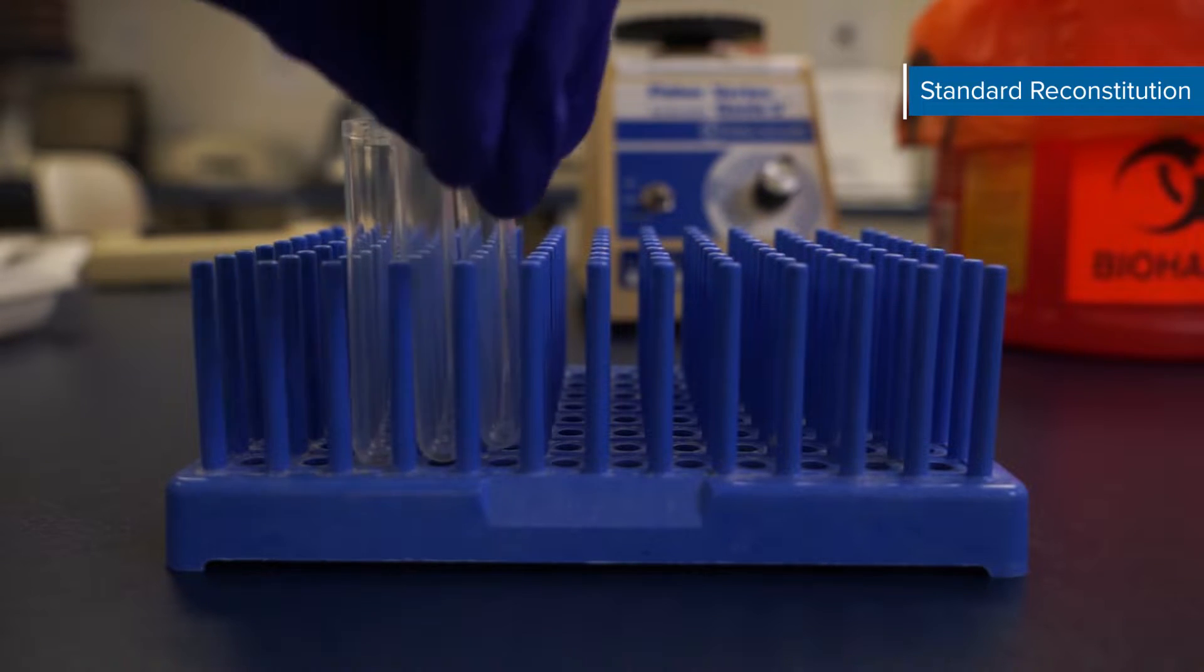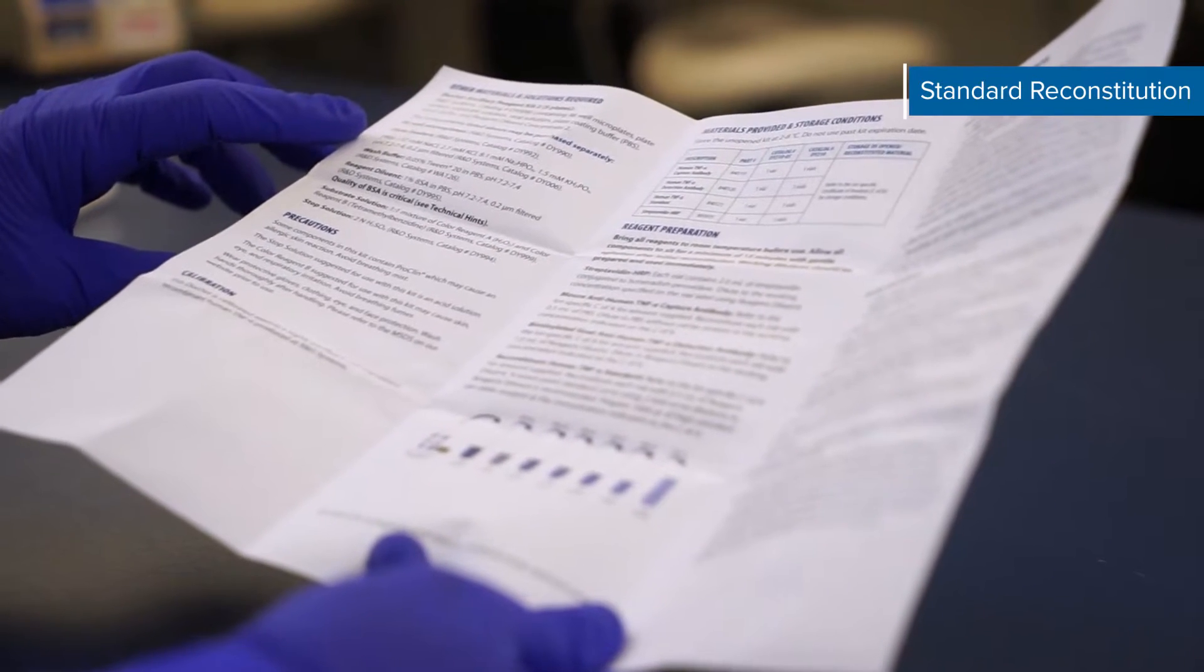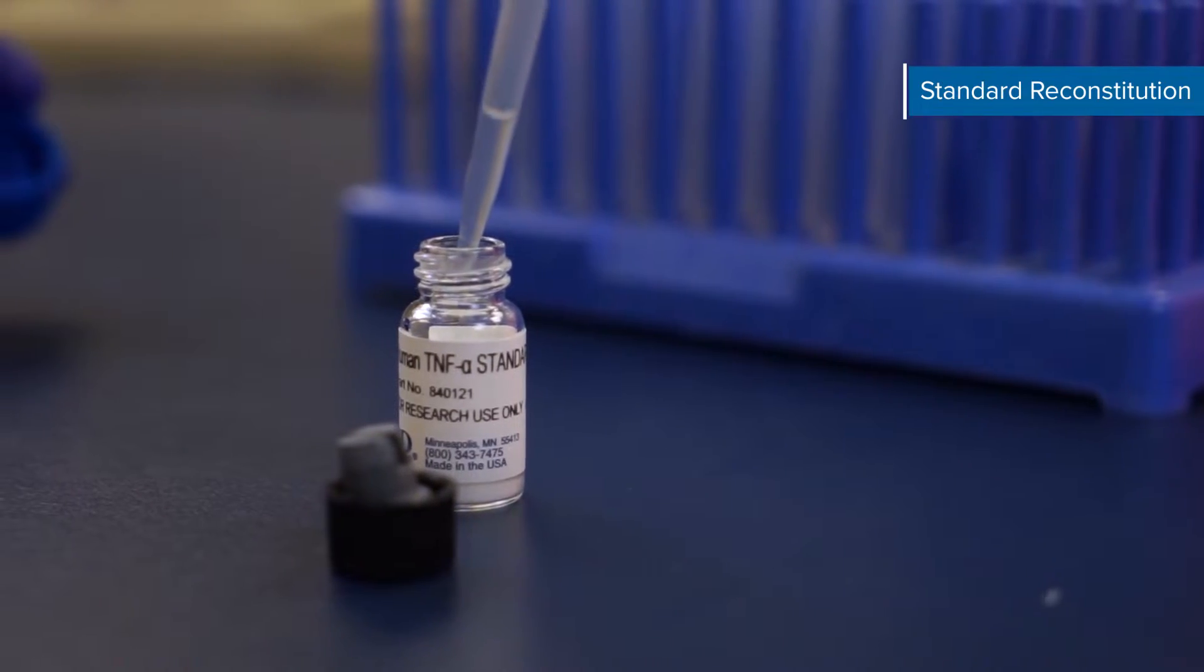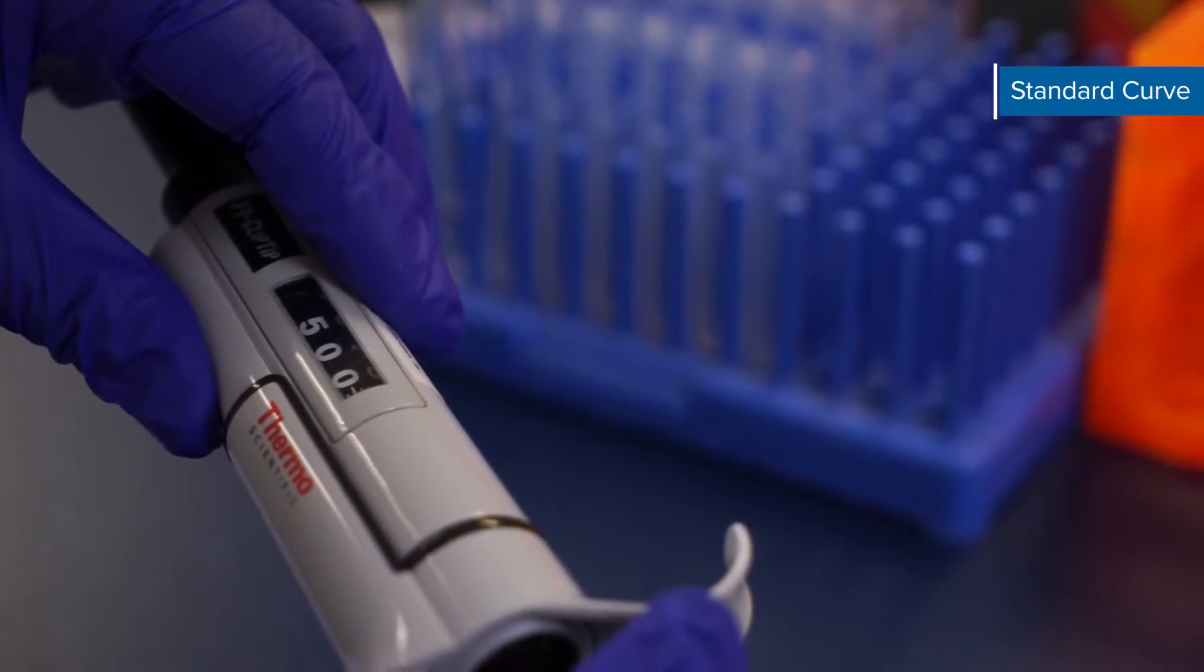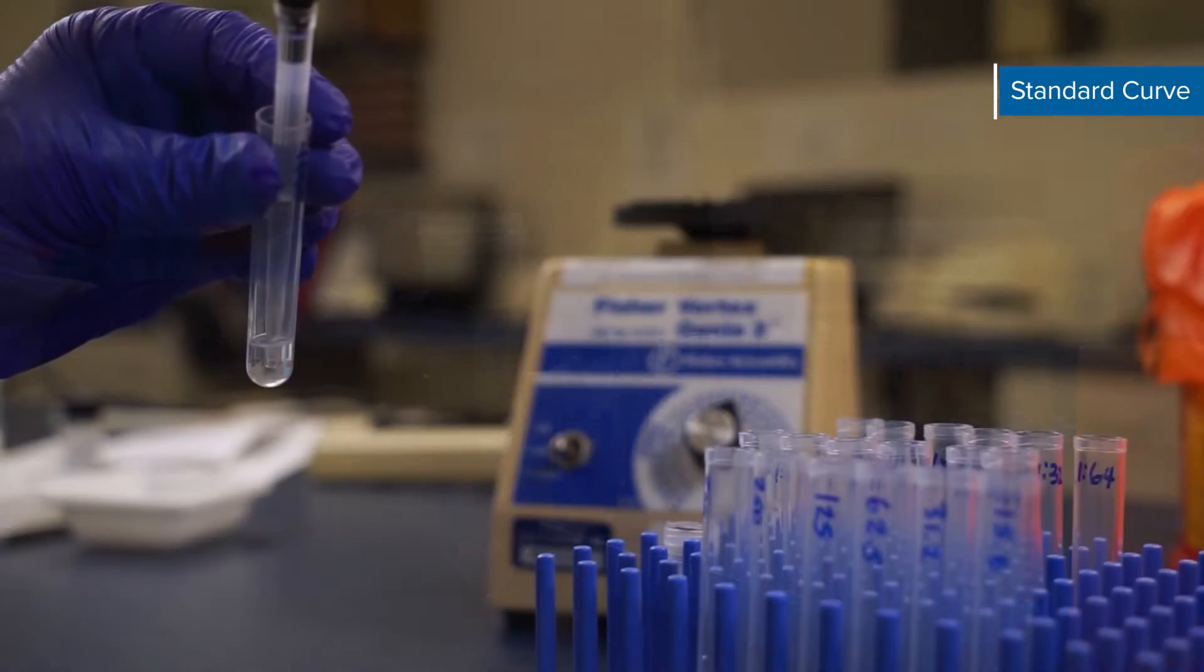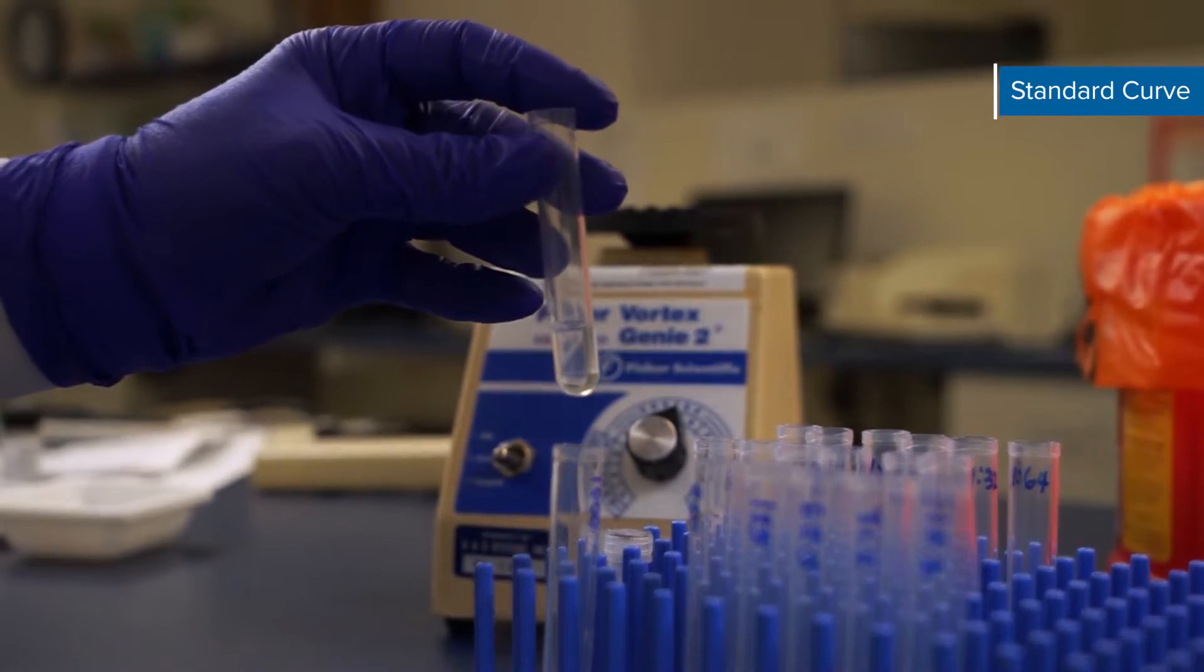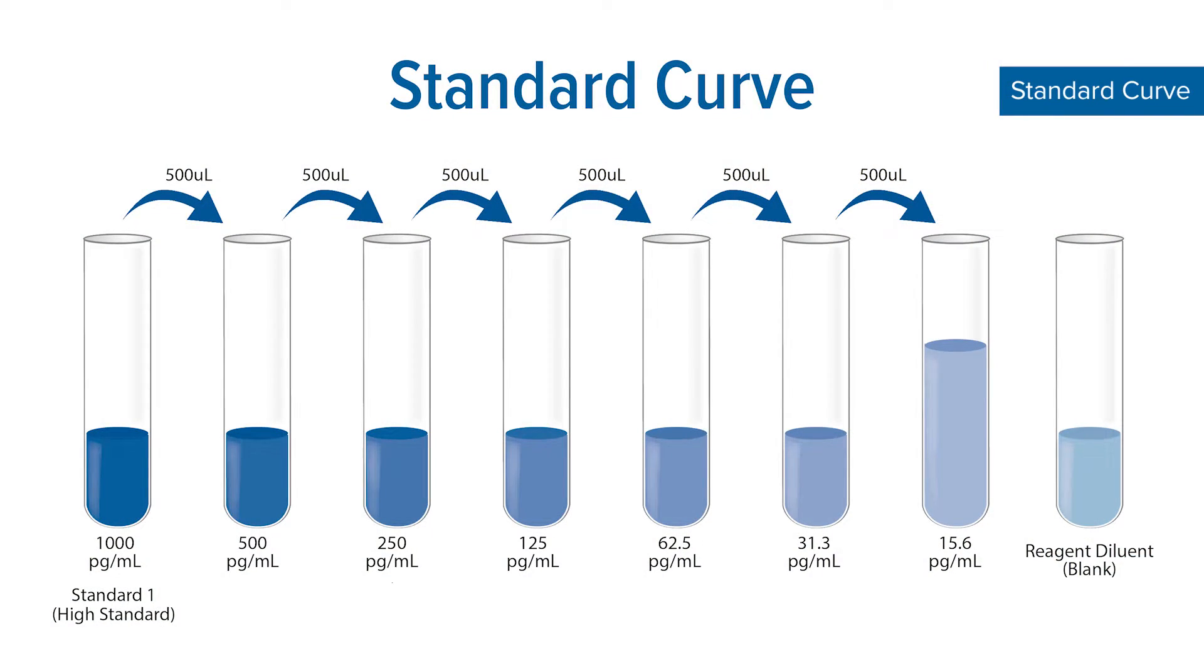The standard curve should be prepared last so that it may be added to the plate with minimal delay. A seven-point standard curve using two-fold serial dilutions is outlined in the assay insert. Prepare 1000 microliters of high standard per plate and place it in the first tube. 500 microliters of reagent diluent is added to the remaining six standard curve tubes. Serial dilute the standard curve by transferring 500 microliters from the 1000 picogram per milliliter standard to the 500 picogram per milliliter tube. Gently mix then transfer 500 microliters from the 500 picogram per milliliter tube to the 250 picogram per milliliter tube and so on until the curve is complete.